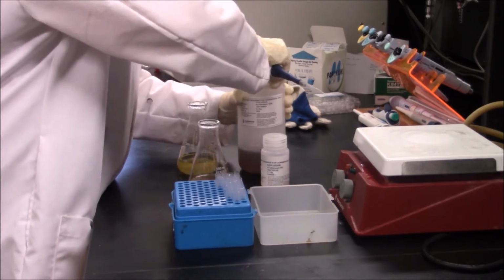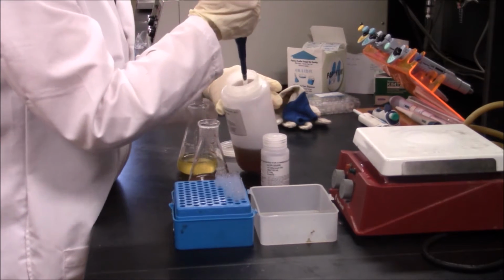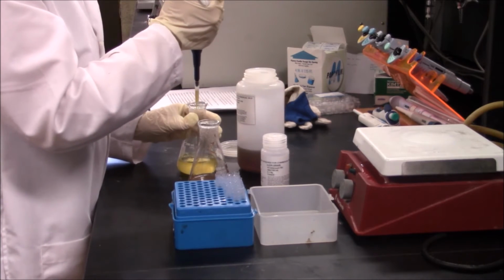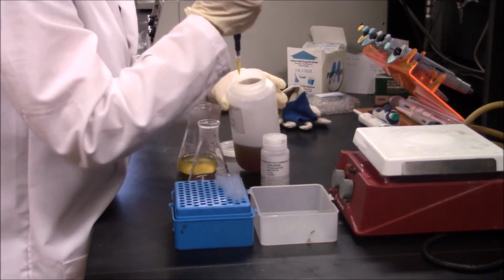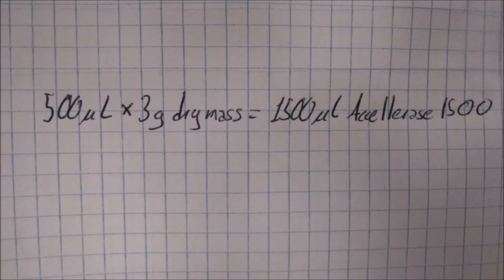Enzymes should be added to the flasks in the following concentrations. One enzyme is called Accelerase 1500. This is actually a solution of more than one enzyme acting together to break down the cellulose. 500 microliters of this enzyme should be added for each gram of dry biomass. This means that for our 3 grams of dry biomass, 1,500 microliters of Accelerase 1500 should be added. This should be done using the 100 to 1,000 microliter pipette.